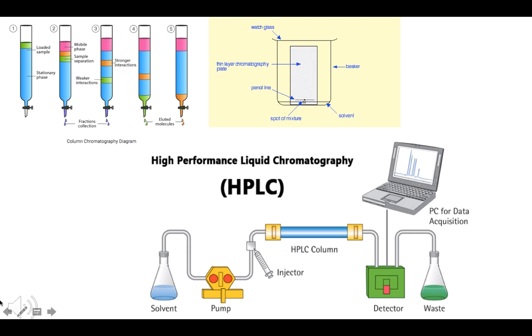So in the case of TLC, it separates based on polarity. Usually in TLC, the stationary phase is called the adsorbent, and it's always polar. For TLC, it's usually a silica polymer. If we put on a mixture of compounds and one is polar, it'll have a high affinity to the adsorbent, so it won't migrate as much. So the polar compound is going to be slower.